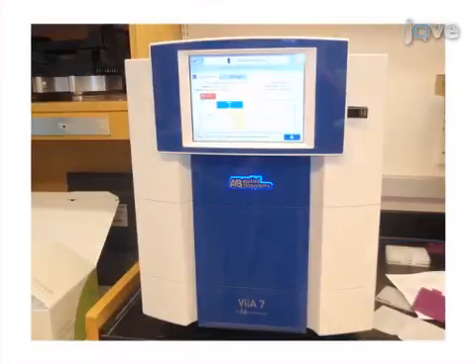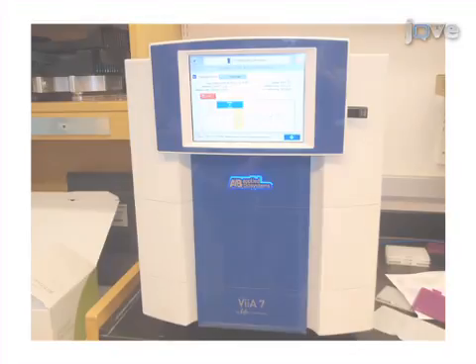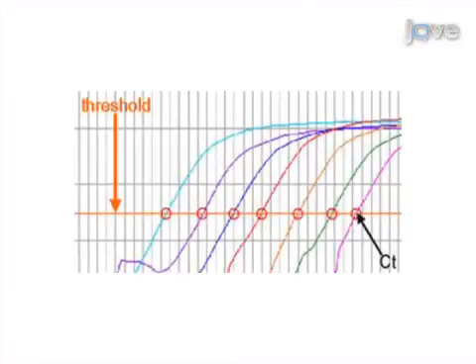Next, the microglial RNA is isolated, and the quality of the sample is analyzed. Finally, real-time PCR for the particular microRNA of interest is performed. Ultimately, the delta-delta CT method can be used to show the relative level of expression of a particular microRNA in microglia.